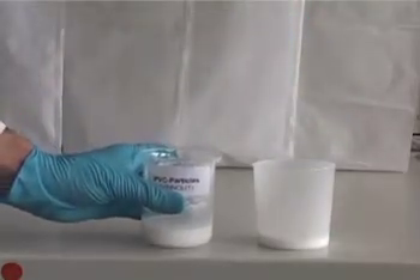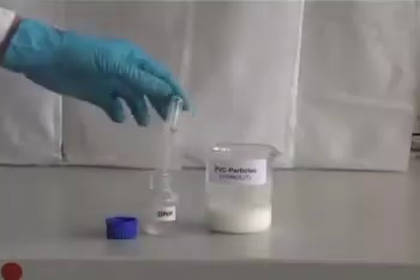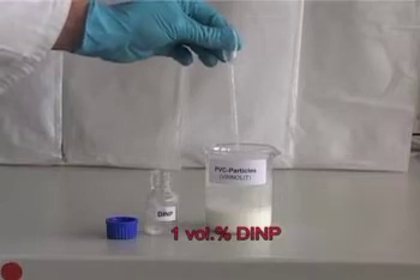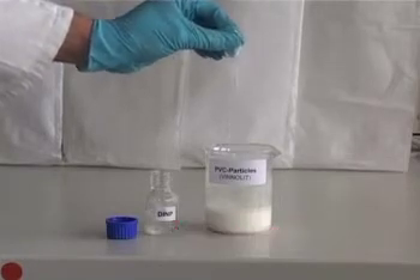To this PVC suspension, we add just 1% of an oil, diisononyl phthalate, which preferentially wets the particles, and stir for several minutes to distribute the oil.